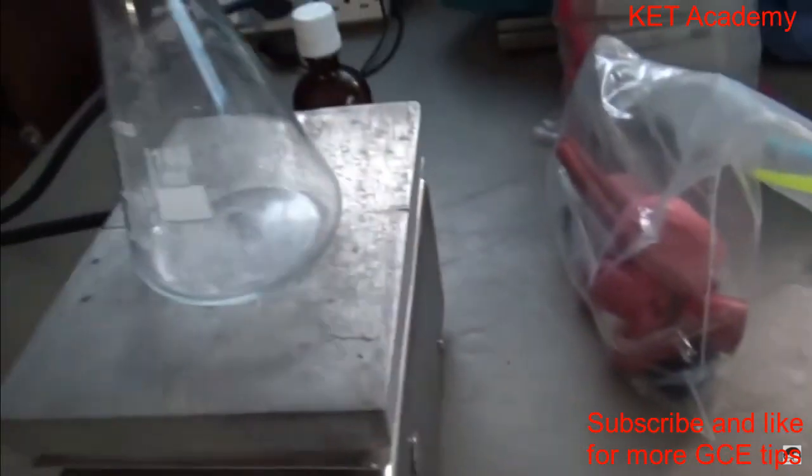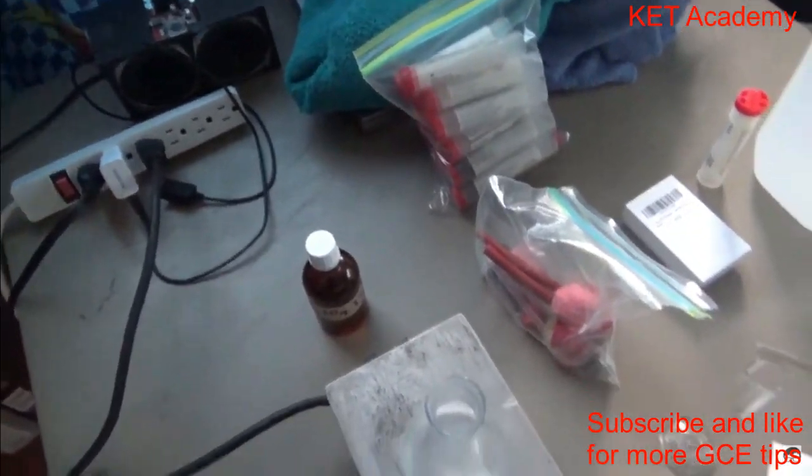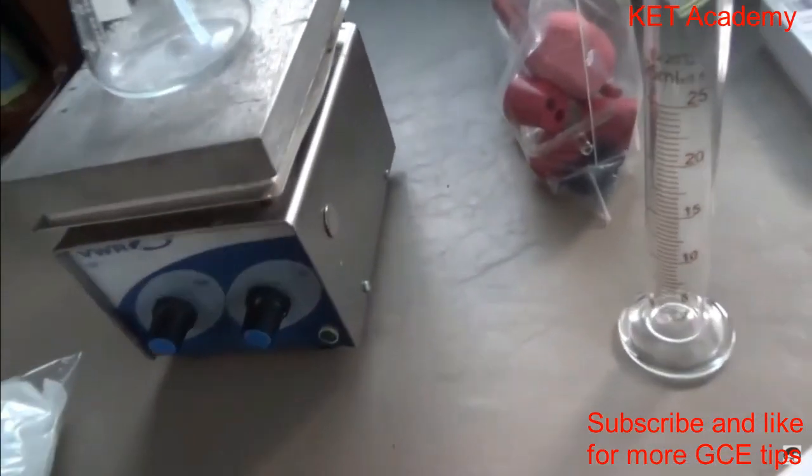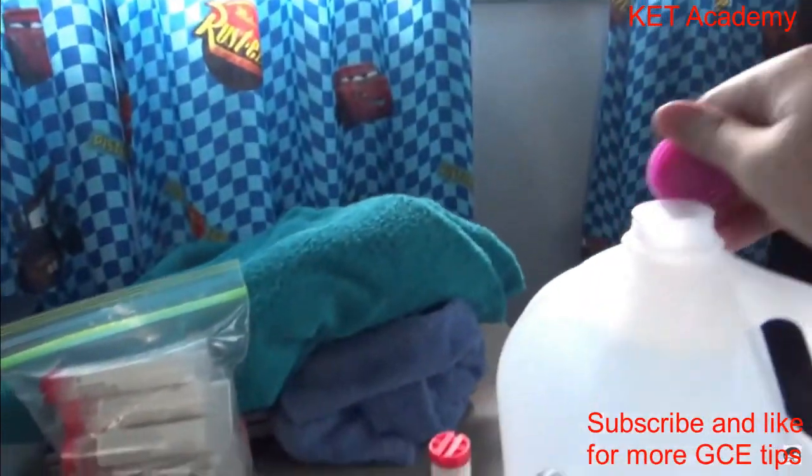So a bit of a change of plans, though. What I'll do is I'll need a funnel. My funnel's dirty. I'm gonna go clean it real quick. Okay, funnel's all nice and clean. We don't want any other variables to mess up our experiment. So the funnel goes in there. Pop the cap.